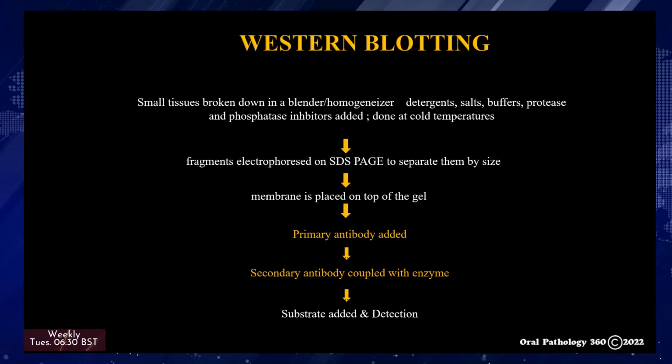Typically, the solution is composed of a buffered saline solution with a small percentage of detergent and sometimes with powdered milk or BSA. The antibody solution and the membrane can be sealed and incubated together for anywhere from 30 minutes to overnight. It can also be incubated at different temperatures, with warmer temperatures being associated with more binding, both specific and non-specific.